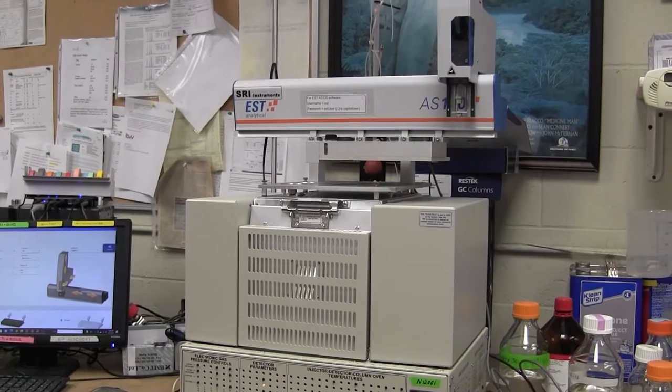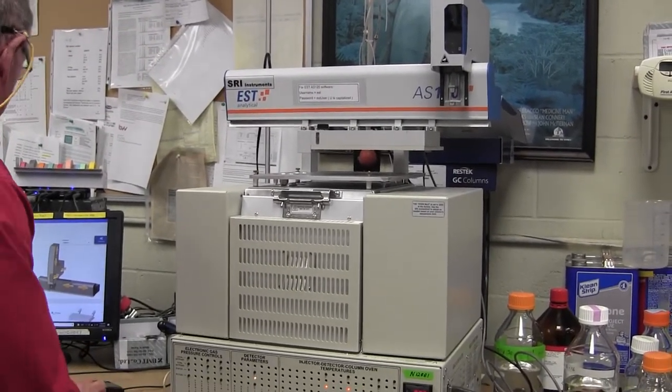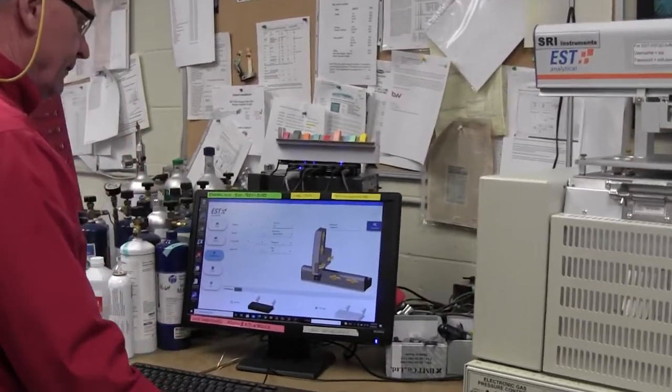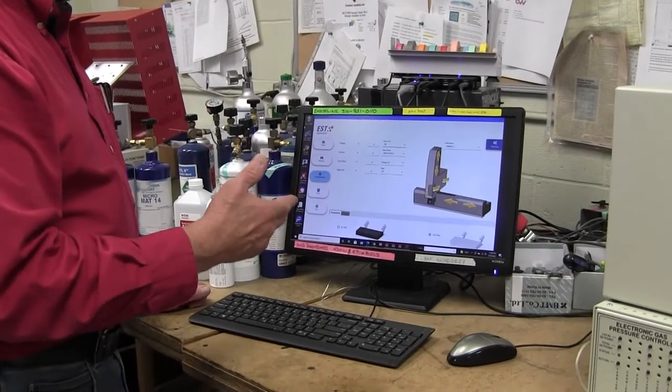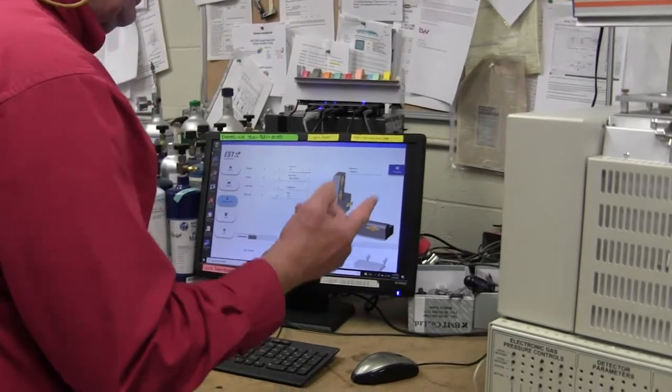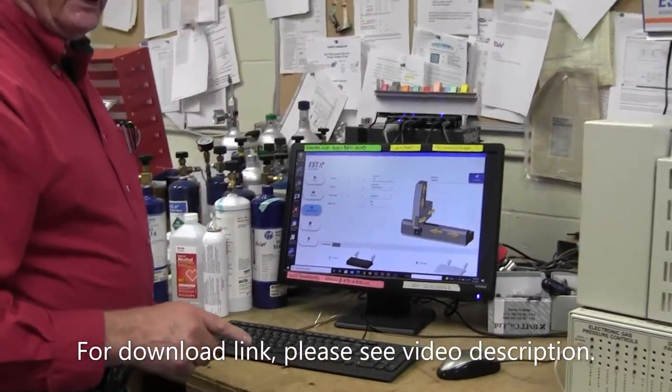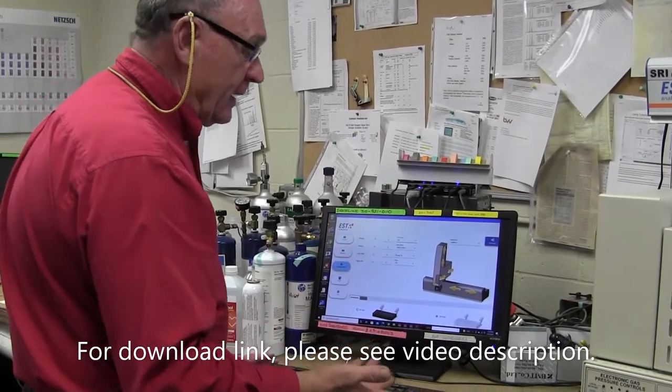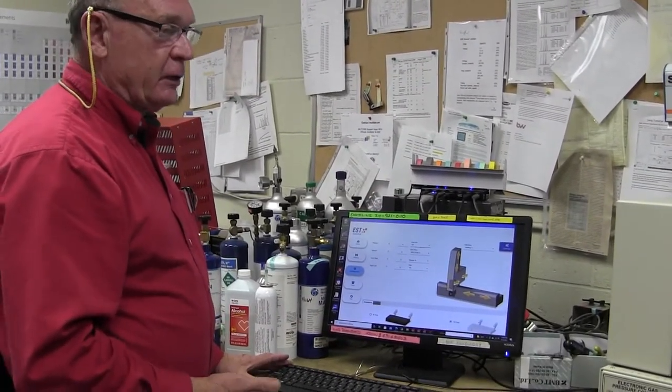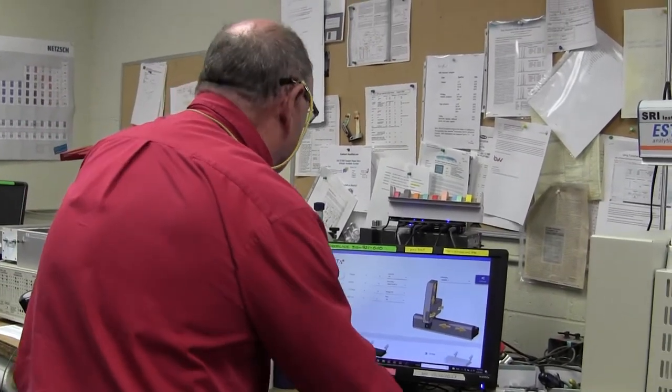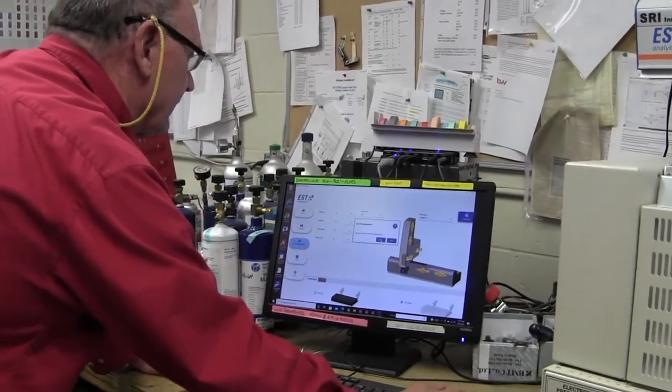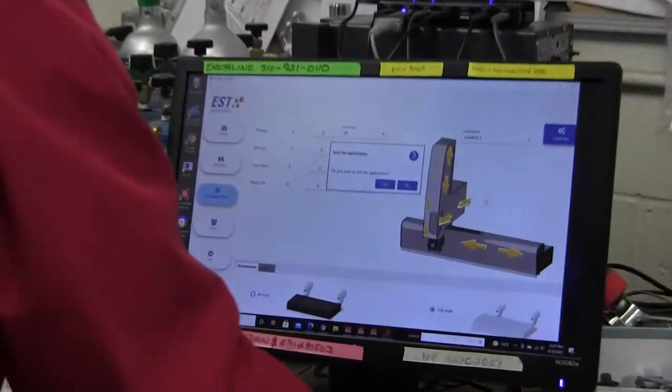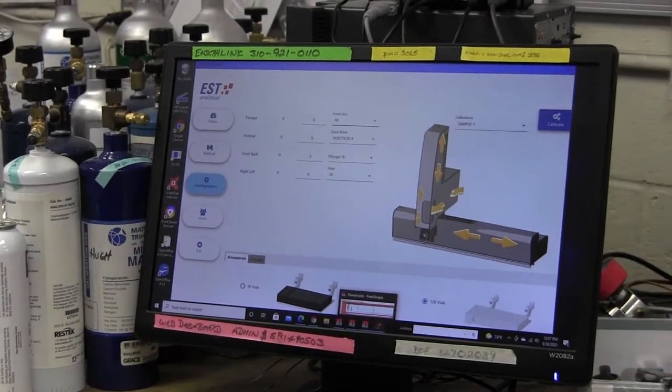So there's a software package that comes on a little thumb drive that you'll get with the auto sampler that contains the program to operate the auto sampler. So you can also download that from our website. We have a copy of it on our website or you can use the little thumb drive. Thumb drive may be more current. It may contain the very latest version. Software tends to be updated on some kind of a basis but the software looks kind of like this. We'll just get started and show you how it operates.